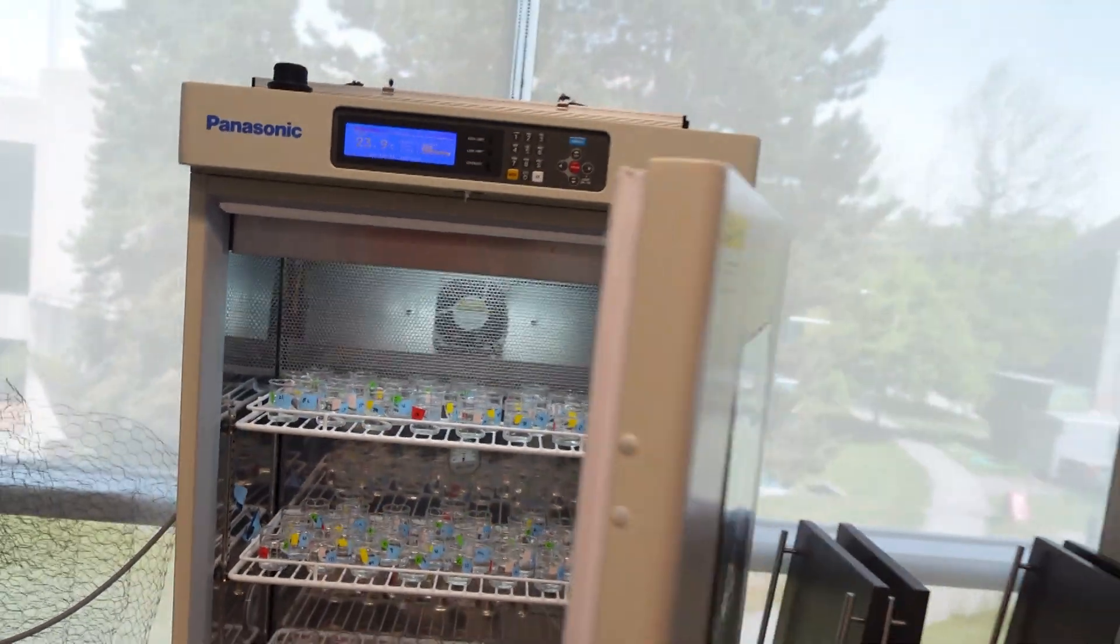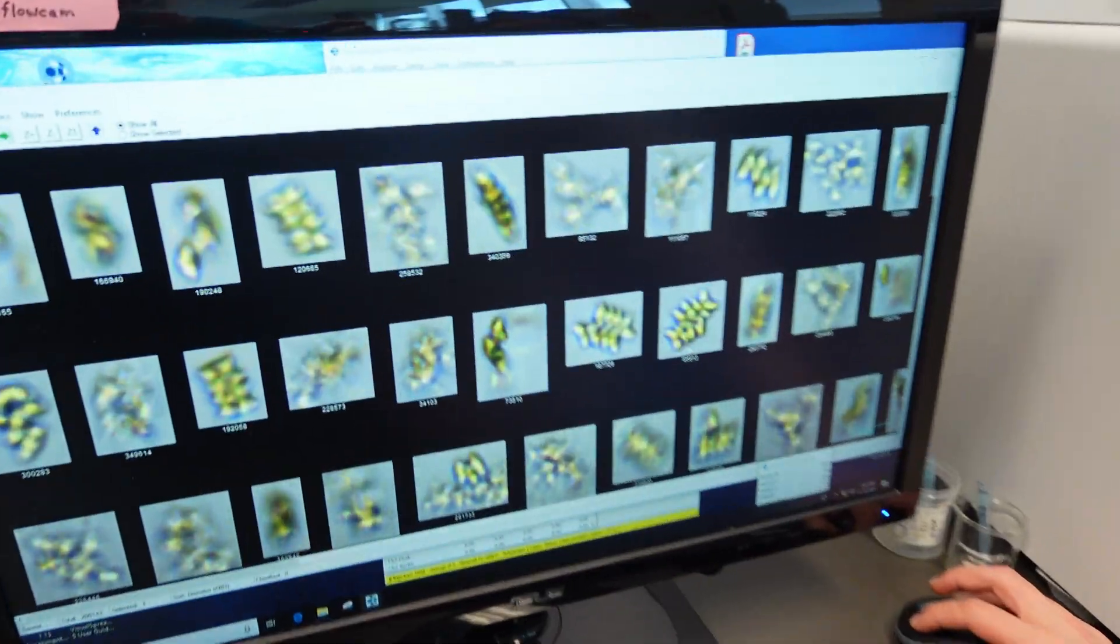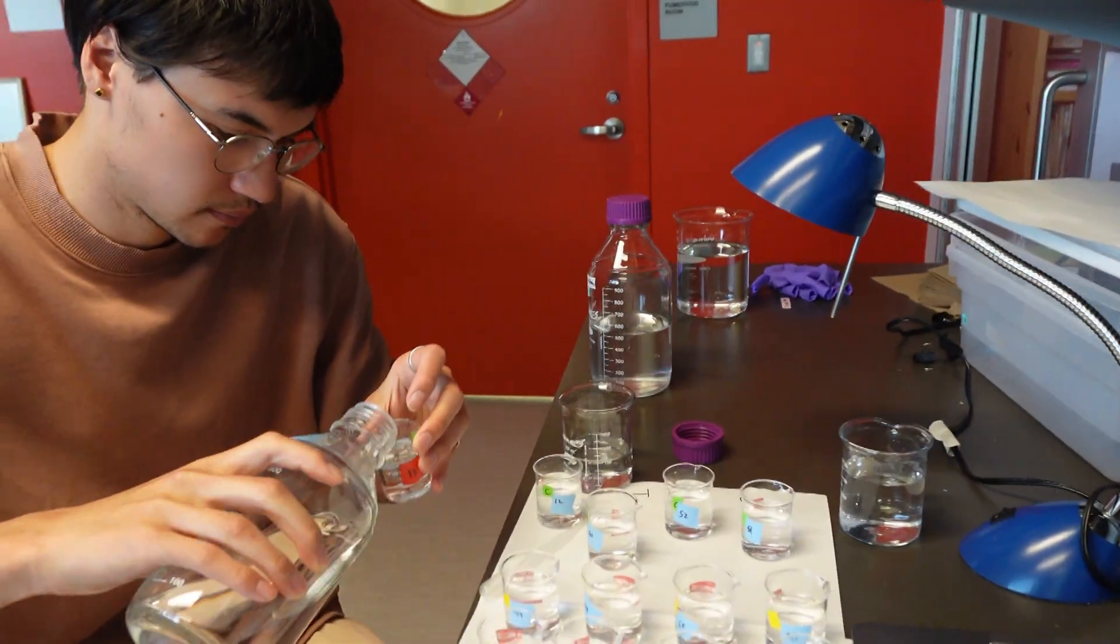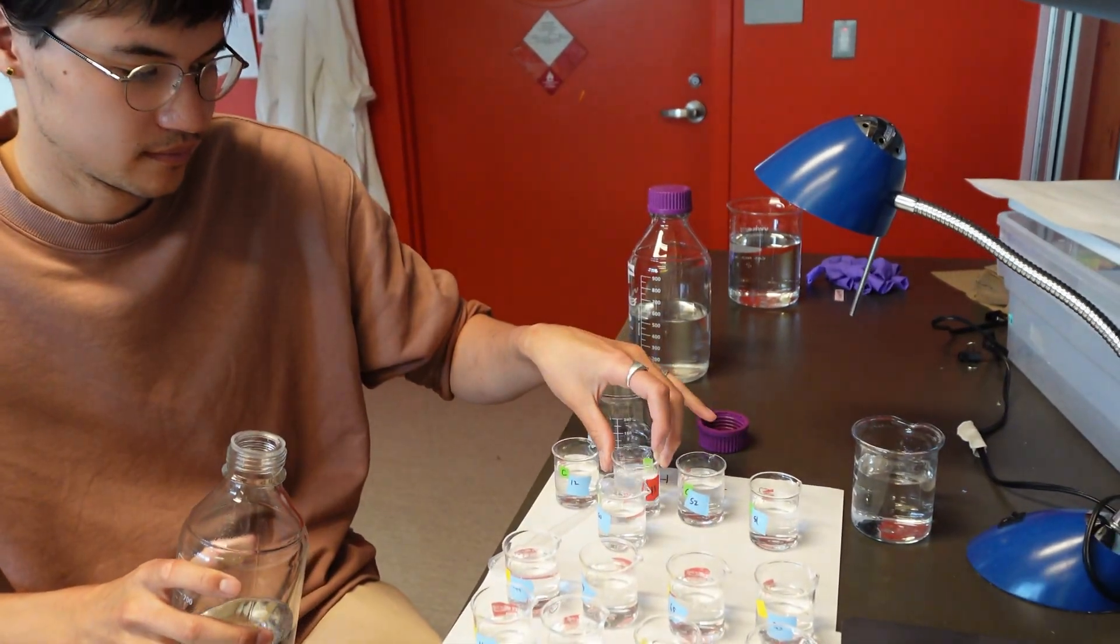When we're in the lab, we're usually growing insects in these temperature-controlled incubators, or we're also growing plankton in these temperature-controlled incubators. We have a lot of beakers or jars everywhere, and each beaker or jar has a few insects or a few plankton in them.